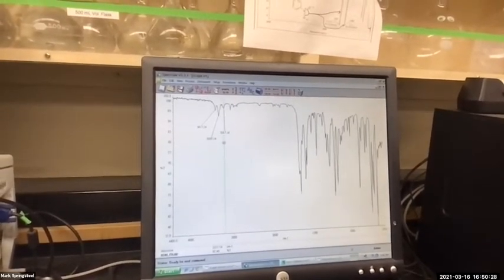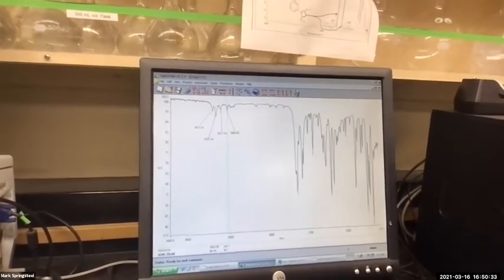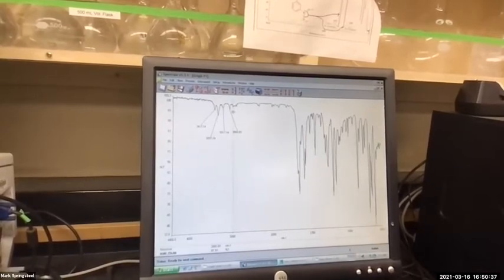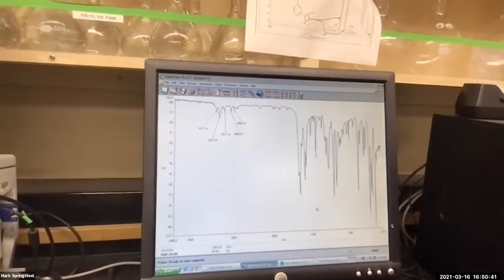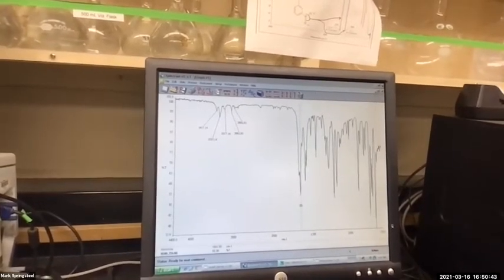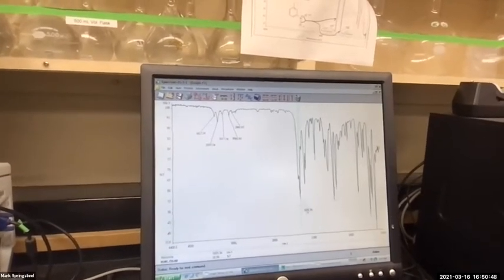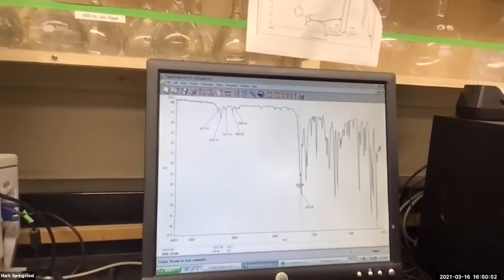So I've got some peaks here, which make total sense to me. Oh, that does too. I don't know about this one. Oh yeah, these are good too. This all makes sense. Nice. So I think this strong one here, 1655, what kind of signal causes that?